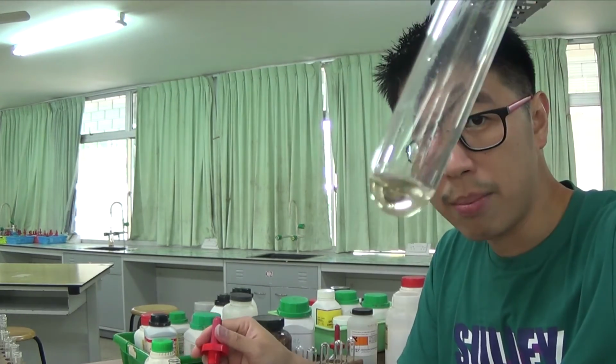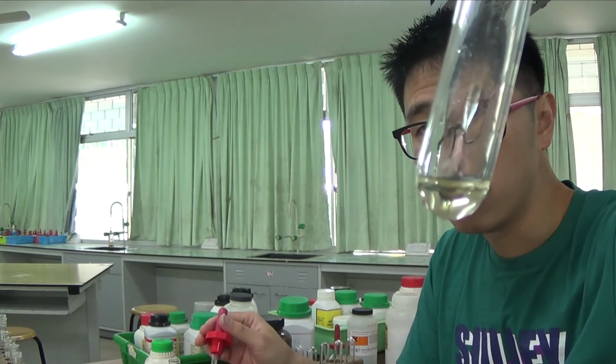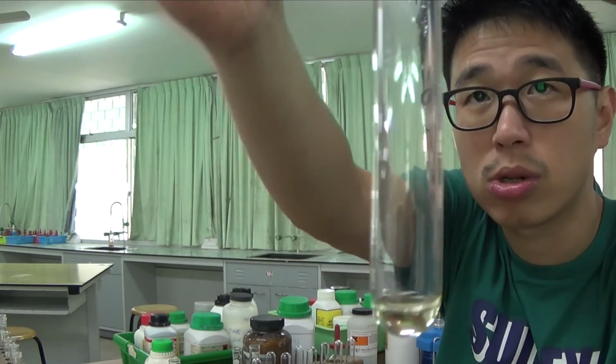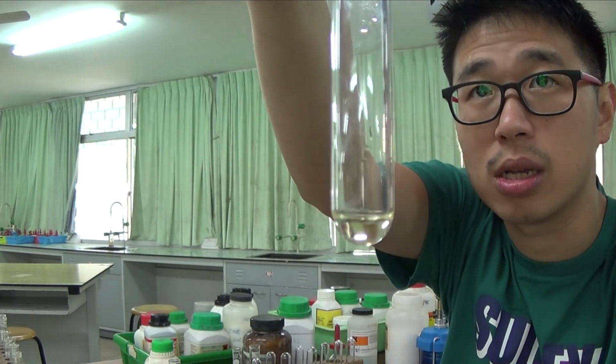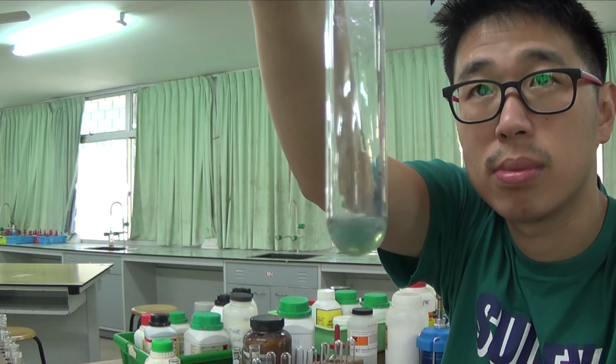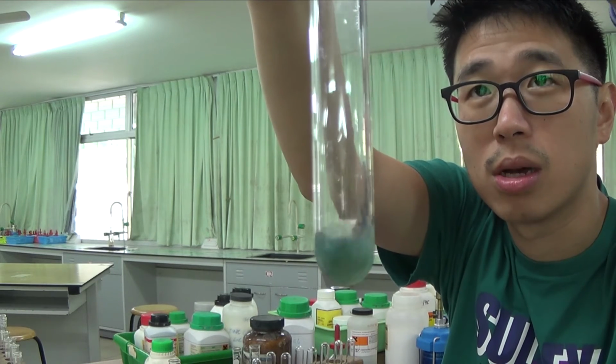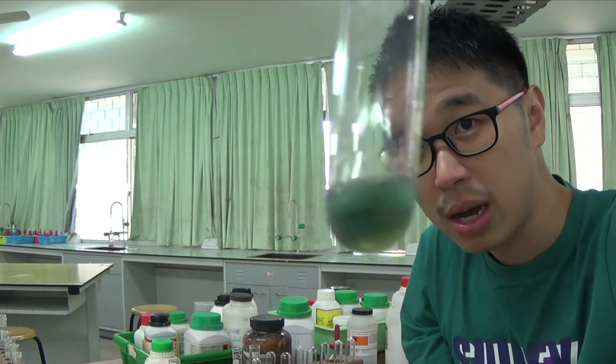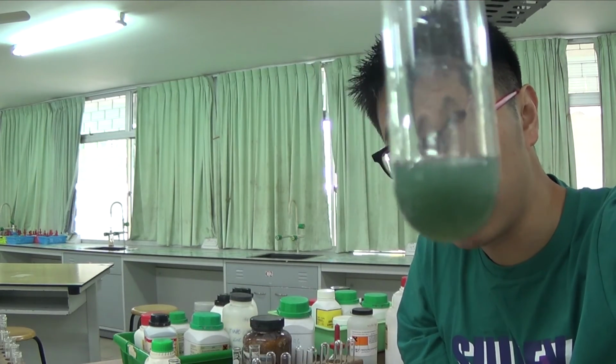So this is the ammonium iron 2 sulfate. We already confirmed the sulfate. This is the sodium hydroxide. I'm just adding it there. Oh, this is good, because it's still green. How we can see is a dirty green precipitate.